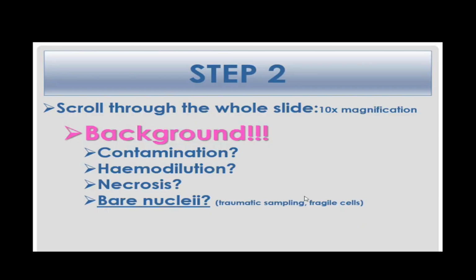Next, are there any naked or bare nuclei, those that are devoid of cytoplasm? It is important to be aware of their presence and not to confuse them with intact cells. A nucleus devoid of cytoplasm tends to swell, and therefore you risk overestimating the size of the nucleus and that of the nucleoli as well. In addition, the presence of naked or bare nuclei can provide information. If they are destroyed, it may indicate rough slide preparation, and resampling may be necessary.